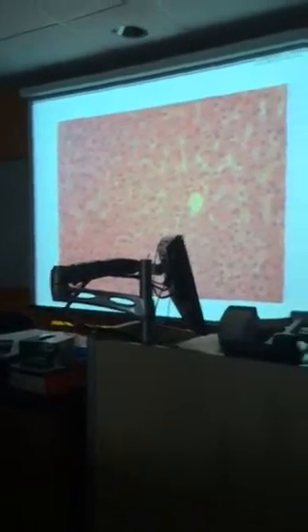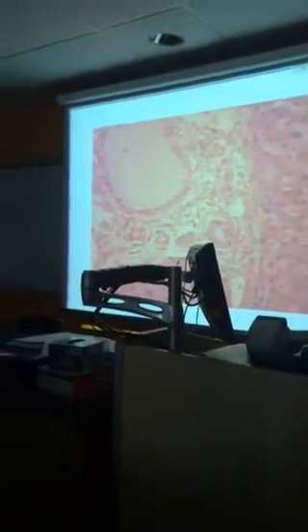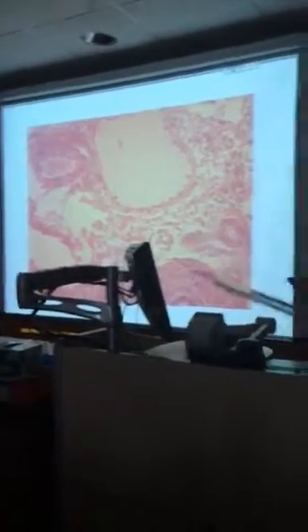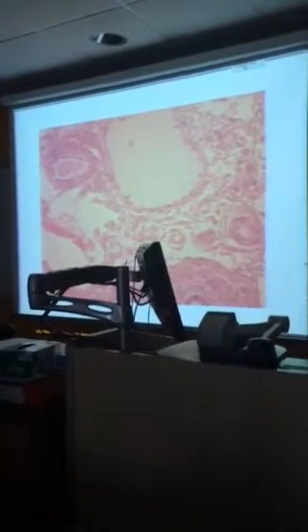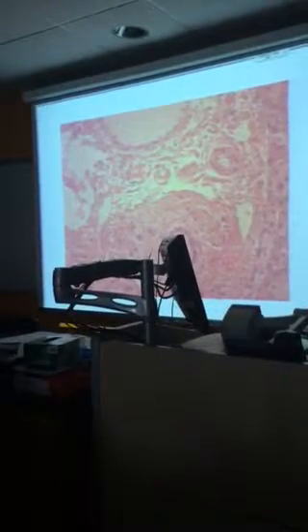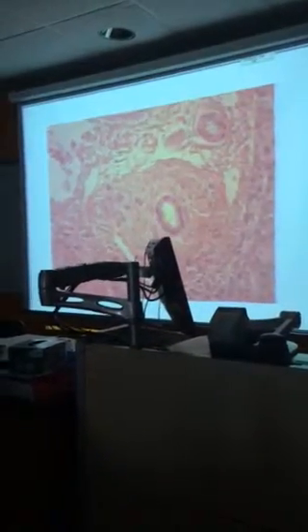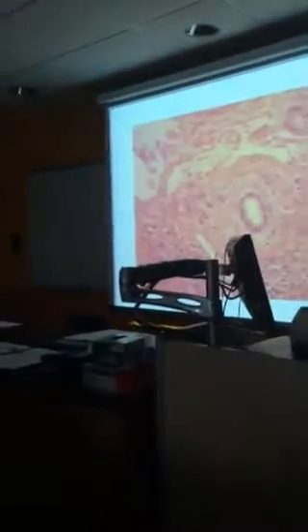Now, where does the blood come from? I'm glad you asked. It comes from two blood vessels in what is called a portal triad. This is on your handout again. Portal triad, triad means three. Two of which are blood vessels, bringing blood into those liver capillaries or sinusoids. And the third vessel is a bile duct. And again, like the ducts we saw in the pancreas, they're made up of simple cuboidal epithelium. You see the rounded nuclei here?